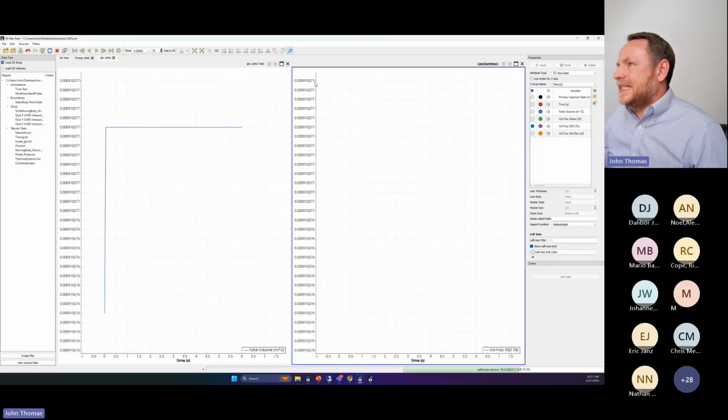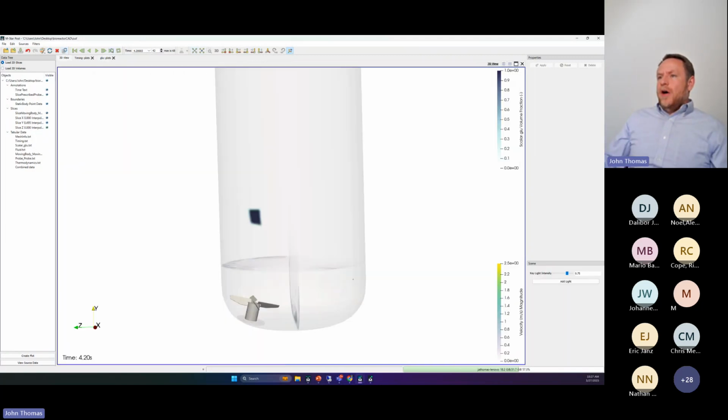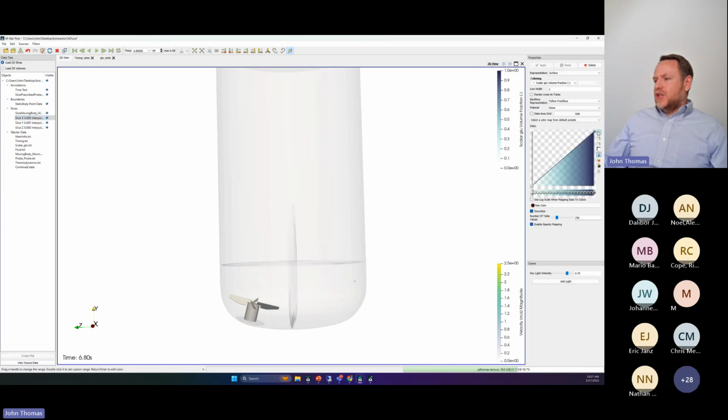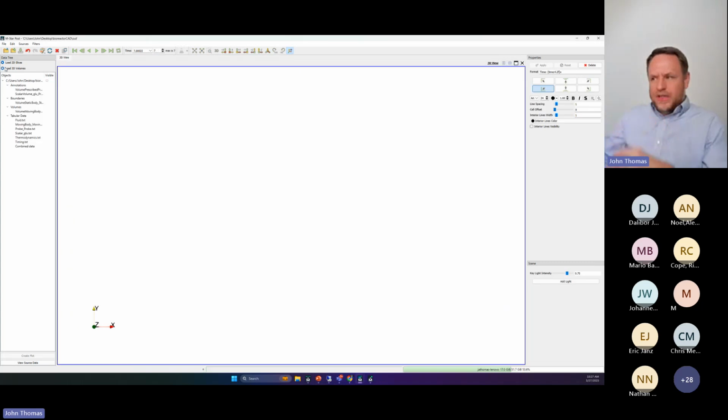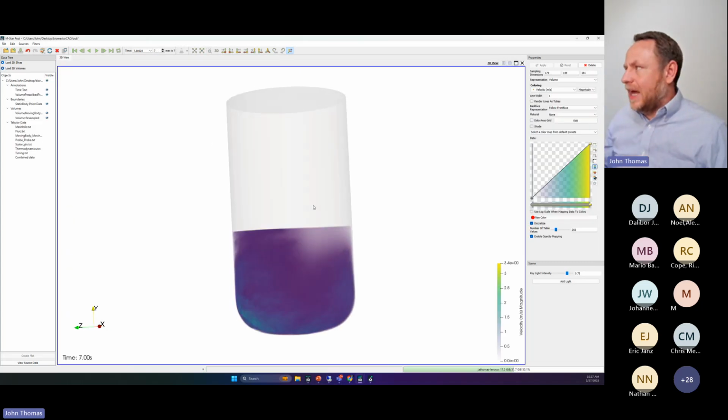Here I can see the RSD. Now, the RSD isn't doing much, but it's going down, which makes sense because this guy is beginning to homogenize, okay? Let me go to the 3D volume here because it's usually a better way to look at bolus additions being homogenized. But if I look at this guy here, I can see there's my velocity.